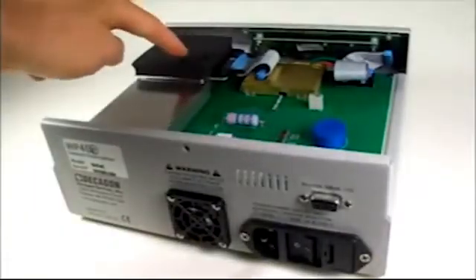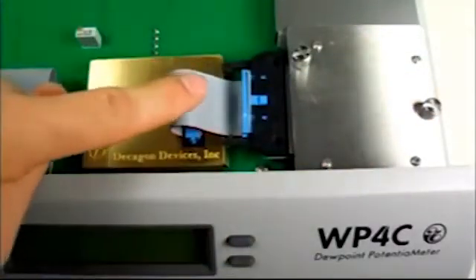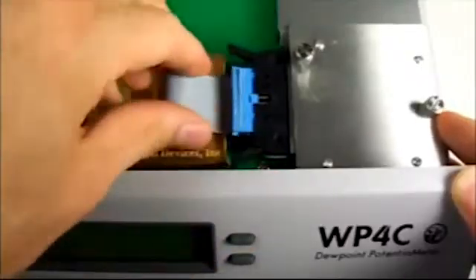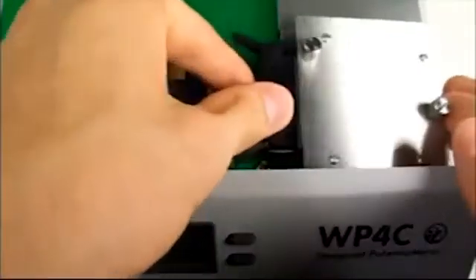This is the sensor block. It is secured to the case by these two thumb screws and this cable. Loosen the screws and unplug the cable by releasing the levers on either side. Carefully lift the block straight up from its mount.